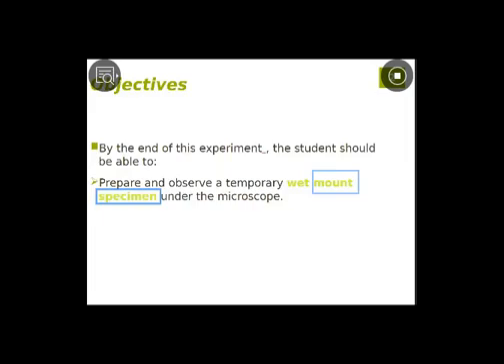These slides are of two types. One type of slide we make using a drop of water. These slides are called wet mount or wet specimen. This is wet mount. Okay, so this is one type of slide. The other type of slide we make without using water. Dry. Nashif. Okay, so specimen two types.